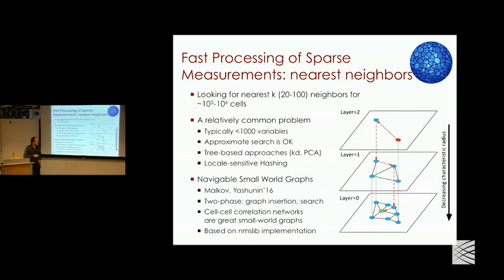There are extra heuristics when moving between some of these nodes, but I think the key thing is how they lay it out in layers. So the heuristic of basically determining the multiplicity branches at each level, which is essentially what this layer density will give you. I think that's where the trick is. And again, it's a trick that works, for instance, for this system.